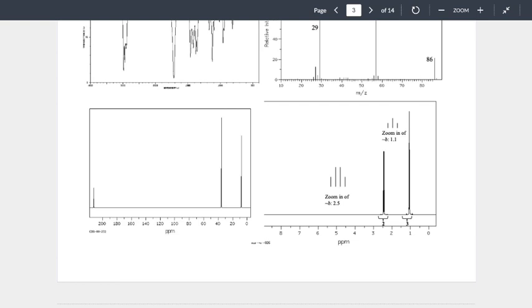So would that be 3H, or is that not? And this being 1, 2, 1, that would be to the second power, so that'd be 2H. Is that accurate or no? It totally is. Oh, yeah? Yeah. Cool.